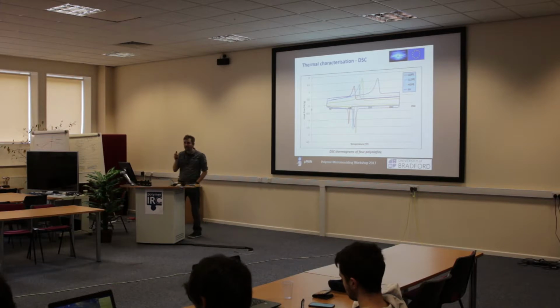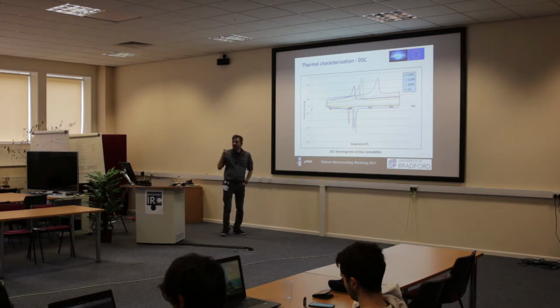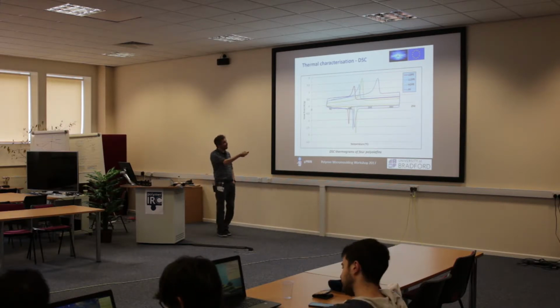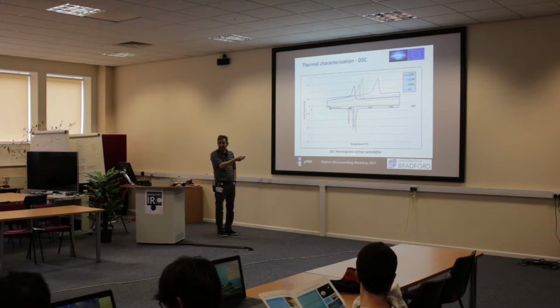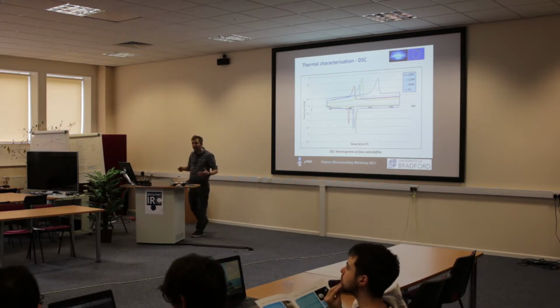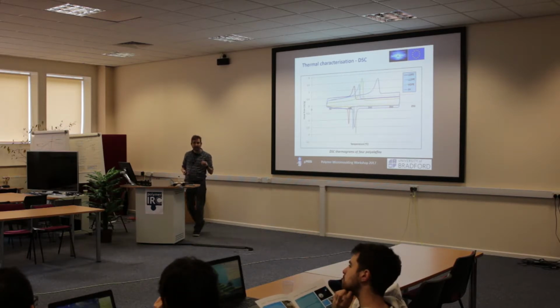Right, so what's actually happening during our test is we're heating the material, we get to this point, and we melt, say, crystal beta, okay? Crystal beta is now molten, and some of crystal beta will then form crystal alpha, okay? And then we'll keep heating, and then all of crystal alpha will melt at this higher temperature, okay? So this peak, you can't simply subtract that off and suggest that all of that is the original crystal form. We've actually changed the material by doing our test, okay? So it's something we need to be pretty careful about.